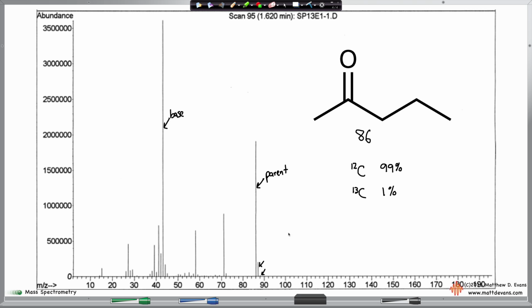In fact, this is one of the principal ways that people figure out the ratios of isotopes in a given sample. Now, eventually we're going to see halogens. Halogens are really interesting in mass spectrometry because something like bromine has 2 equally abundant isotopes. We're going to see an example of this in just a second, but it has 2 equally high peaks, which is really cool.